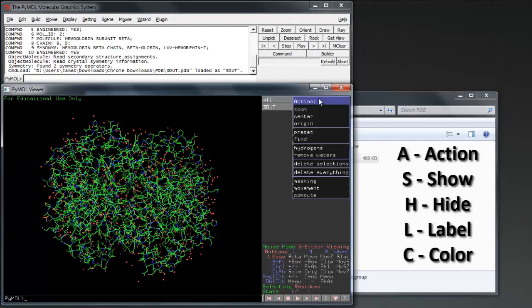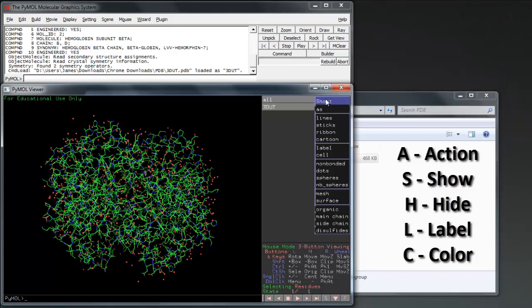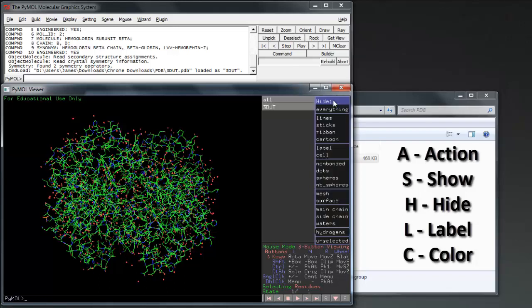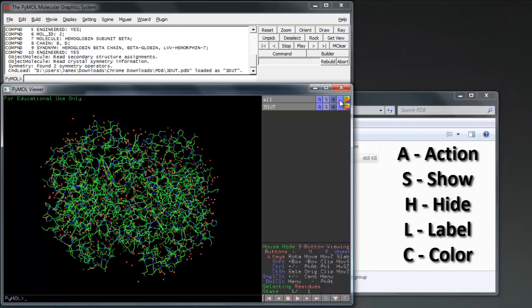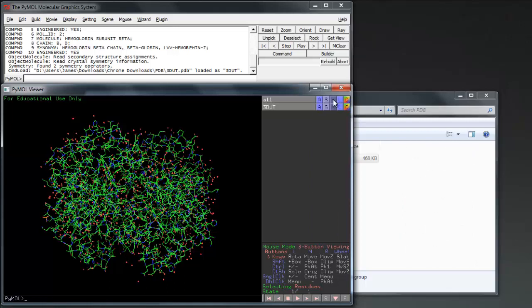Action allows us manipulation of the objects. Show allows us to show different components. Hide allows us to hide different components. And Color allows us to color different components.